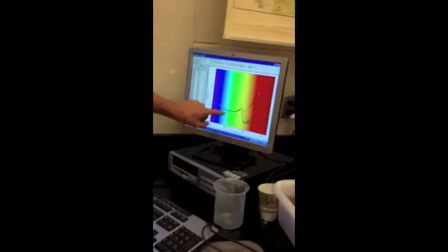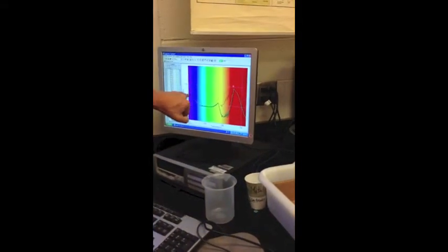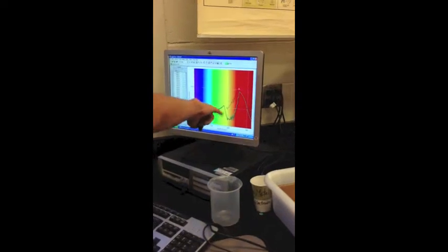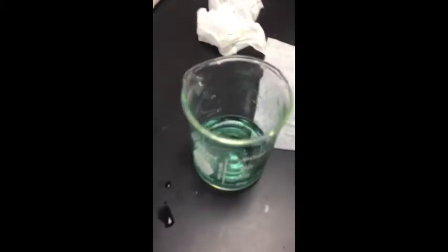So you can see this red line. It was the kind of rose-colored one, which makes sense. And you can see that there's actually two lines here, the green one and a bluish black one, and they're about the same because we had a lot of green and not that much red. So you can see that's kind of close to this. And yeah, that's basically all you really have to do.